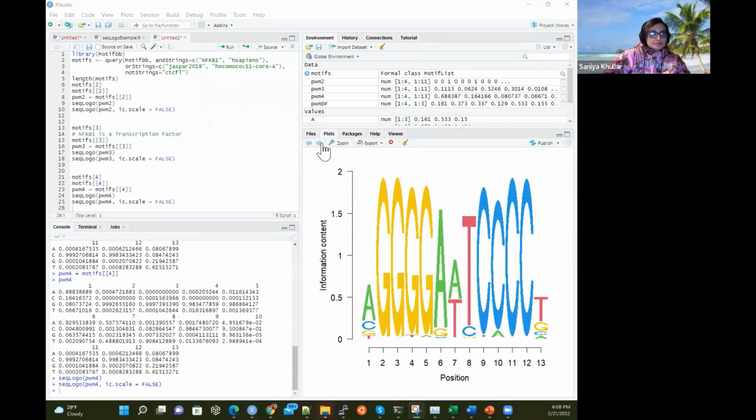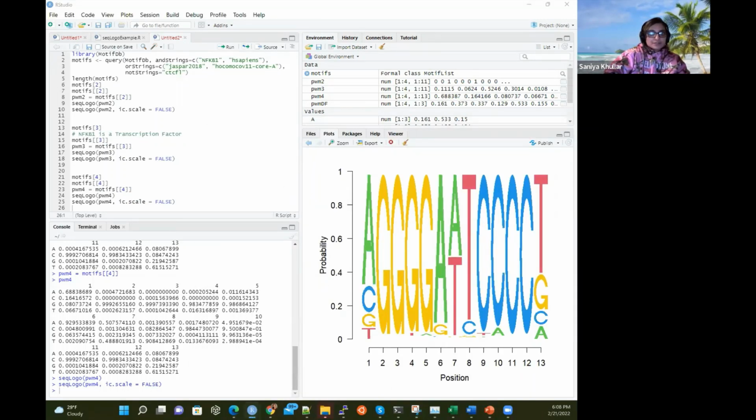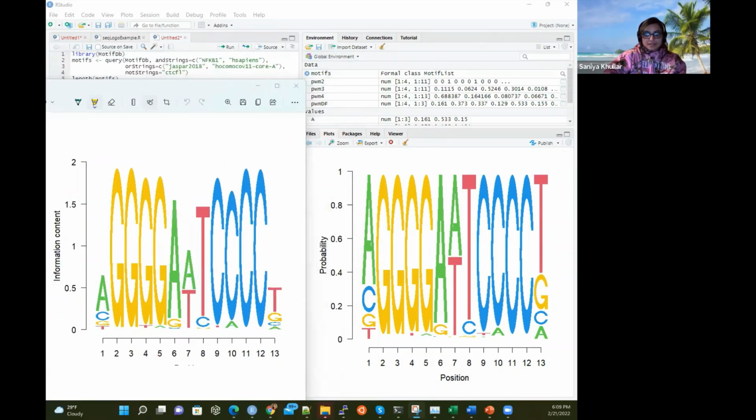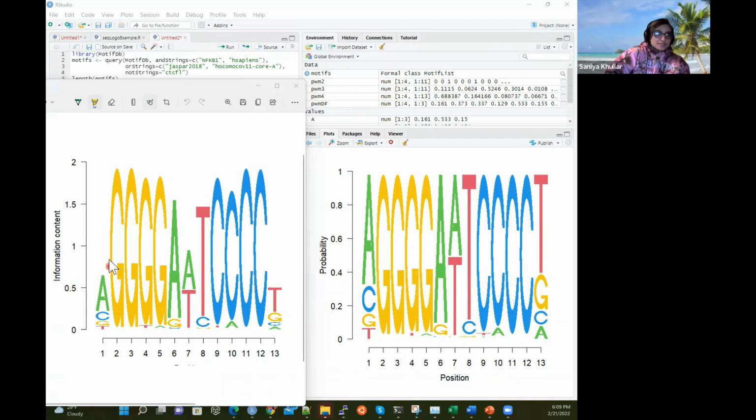Let me also show you that they're kind of the same information, and you can go from one to the other. You can see how they map to each other: if there's A, C, G, T, A is not as tall in probability as the majority, like G, G here. So that's why this information is a lot less. In these cases, it's a bit more.